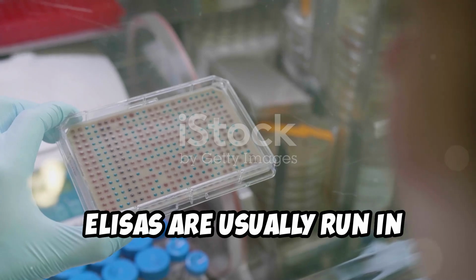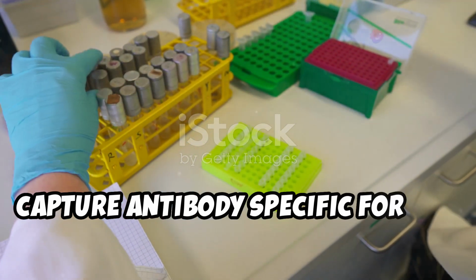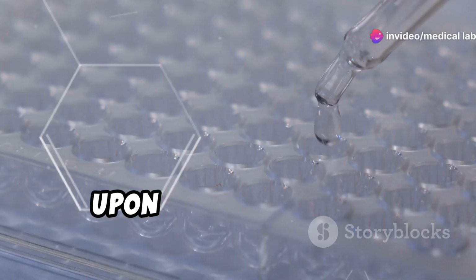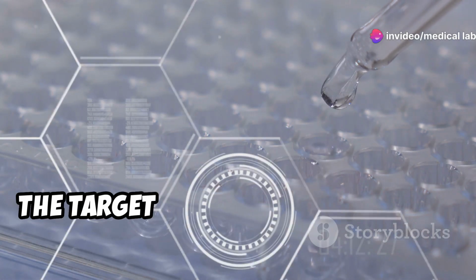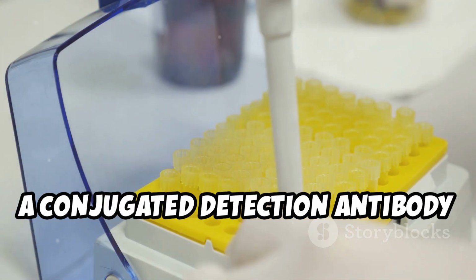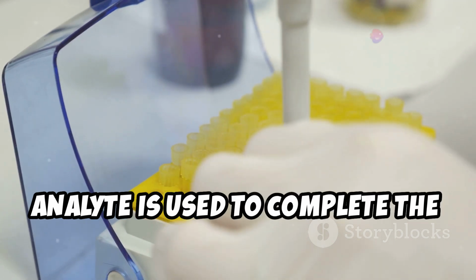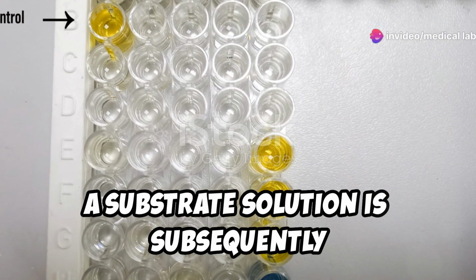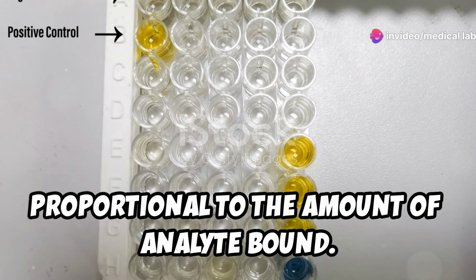ELISAs are usually run in 96-well microplates, coated with a capture antibody specific for the analyte of interest. Upon incubation with experimental samples, standards, or controls, the target analyte is captured by this antibody. A conjugated detection antibody that binds to a different epitope on the target analyte is used to complete the sandwich. A substrate solution is subsequently added to produce a signal that is proportional to the amount of analyte bound.